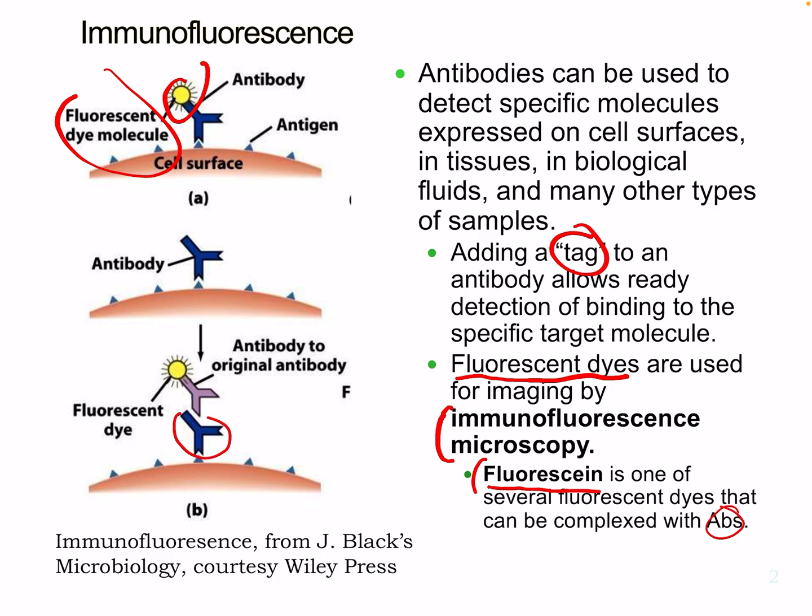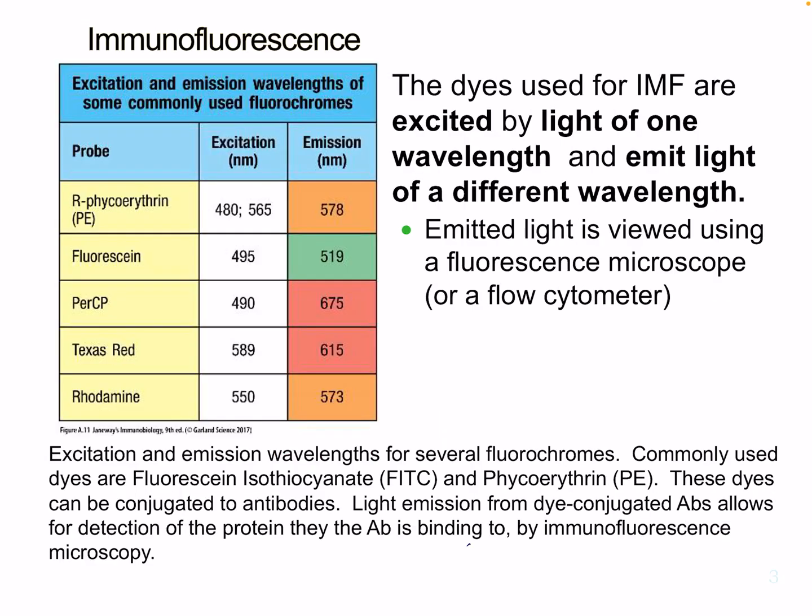And then we have this antibody. Then our antibody will bind to the original antibody. This is referred to differently in some textbooks. Like I said, there are many different names and excitation and emission frequencies with different colors: orange, green, red, etc.